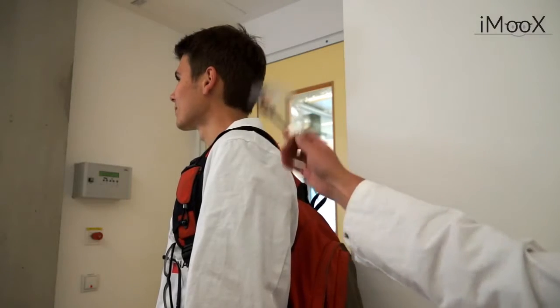Much better! Here's Larissa, and she brought you a pair of safety goggles. Now you are ready to enter the lab.